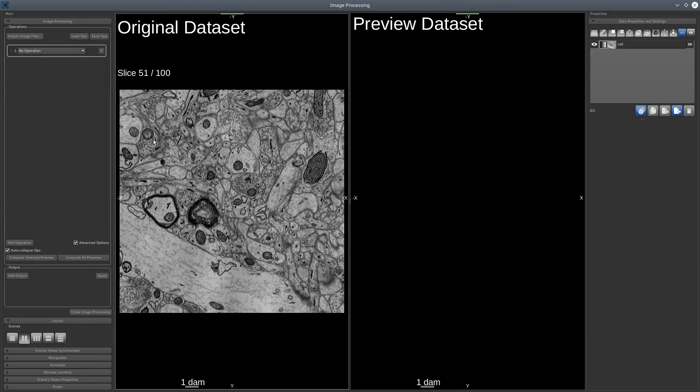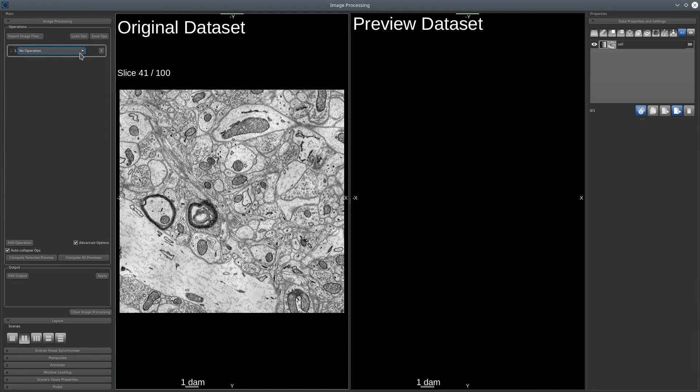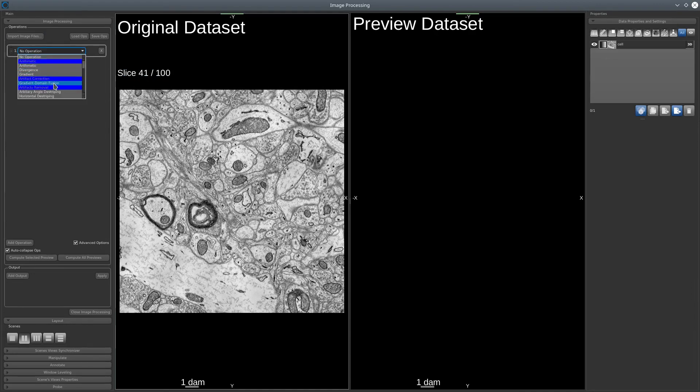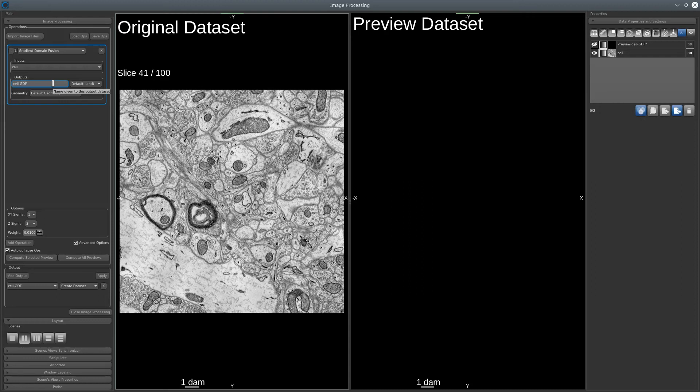To correct this artifact, we will need to use the gradient-domain fusion, just right there. The gradient-domain fusion is a two-step filter. It's first an anisotropic smoothing, and then a mapping of the high frequency to keep the border information.